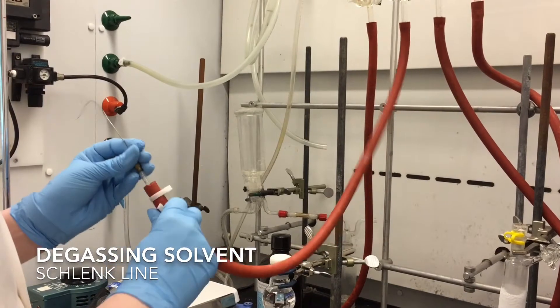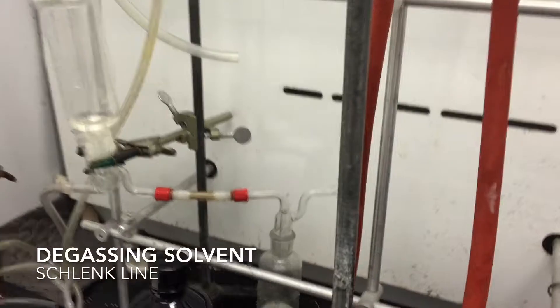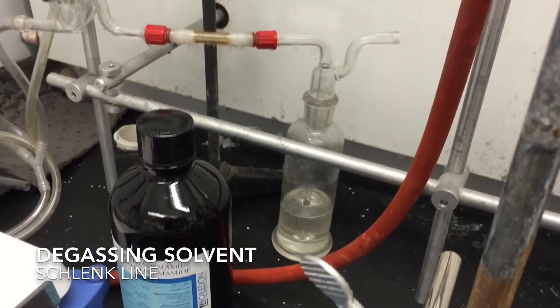The first thing we're going to do is turn on the nitrogen bubbler. As you can see by the bubbles at the back, the nitrogen is currently flowing through. You don't need an incredibly high flow rate of nitrogen — you just need to see a couple bubbles.